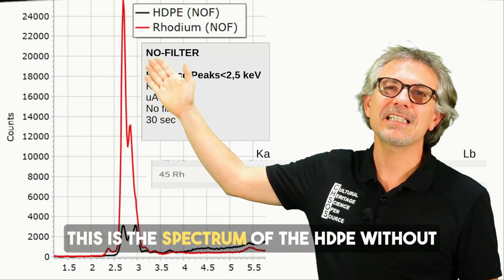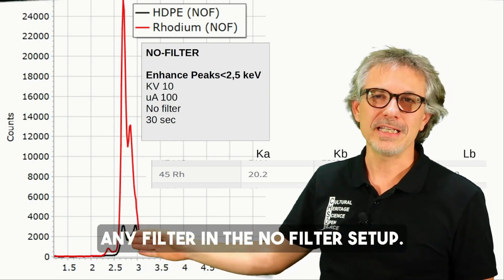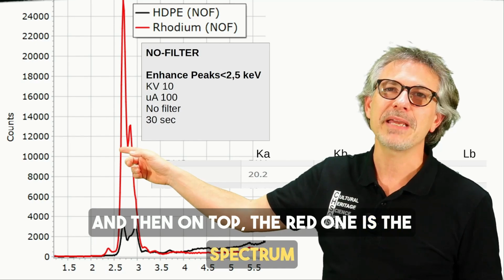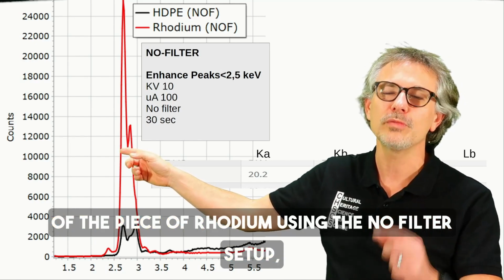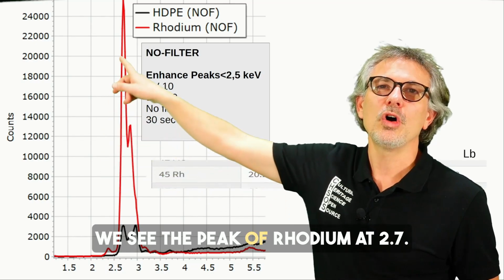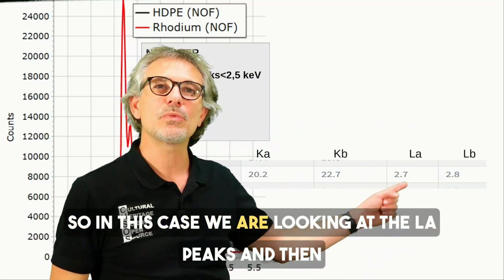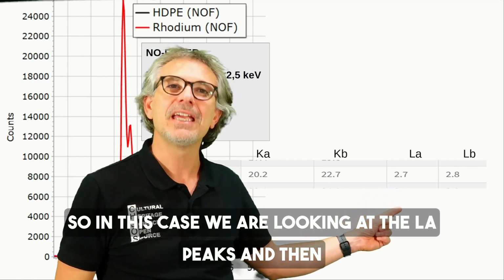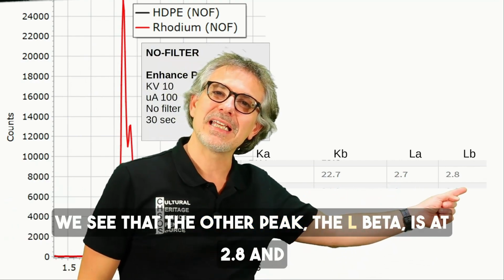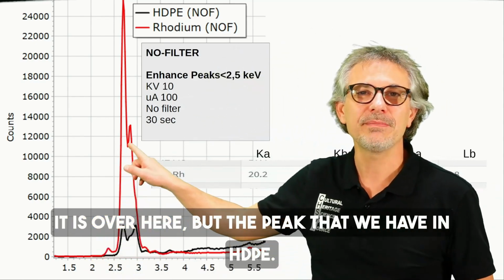There it is. This is the spectrum of the HDPE without any filter in the no filter setup, and then on top the red one is the spectrum of the piece of rhodium using the no filter setup. We see the peak of rhodium at 2.7. So in this case we are looking at the L alpha peak. And then we see that the other peak, the L beta, is at 2.8, and it is over here.